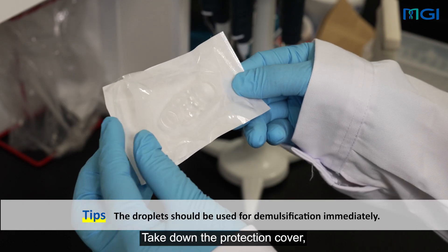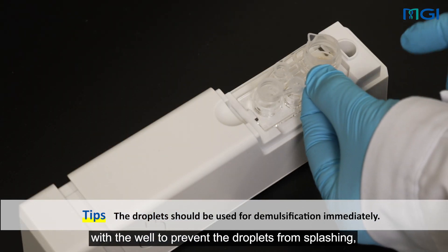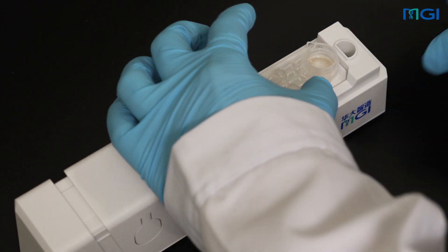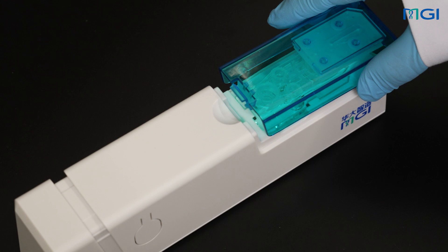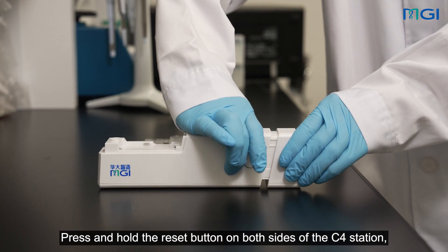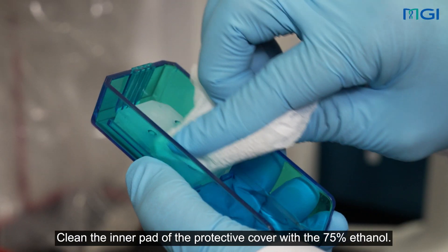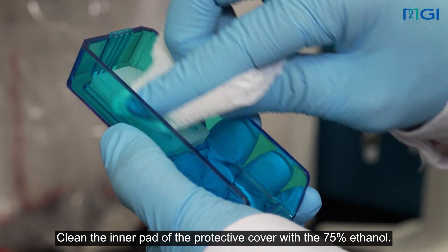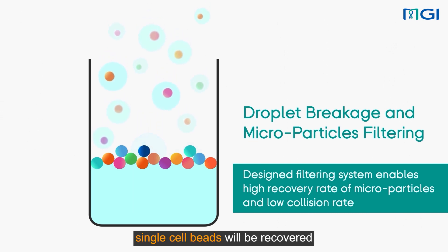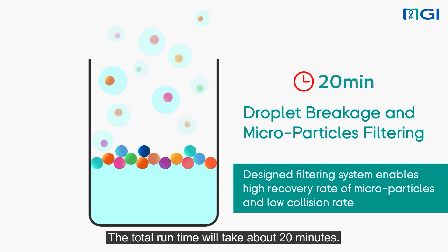Take down the protection cover, mount the chip sleeve on the chip by correctly aligning the sleeve with the well to prevent the droplets from splashing, and remove the chip for subsequent demulsification. Press and hold the reset button on both sides of the C4 station, and push the tail to its original position. Clean the inner pad of the protective cover with 75% ethanol. Next operation is the demulsification; single-cell beads will be recovered by the demulsification recovery system. The total run time will take about 20 minutes, and it needs to be noted that the user should have a vacuum pump set up for this operation.